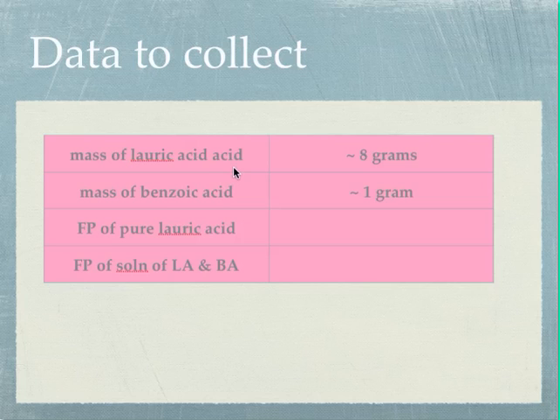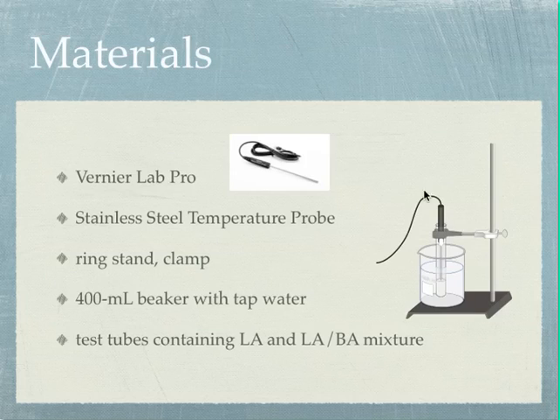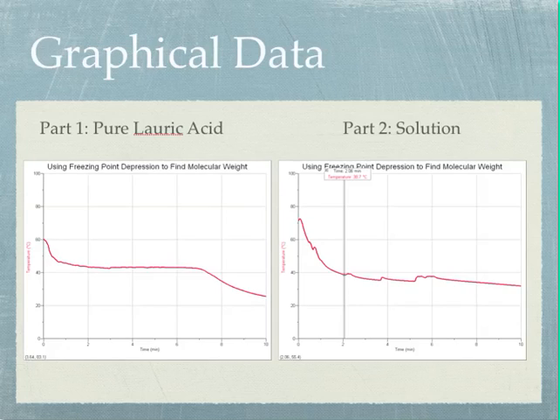Now, interestingly enough about both of these, because their freezing point or melting point is so low, we're actually going to heat this up to turn it into the liquid phase. From then, we're going to cool it in our setup, which we have again over here, and then we're going to be able to watch it cool down. When we do, the graphical data you get is going to look something like this.